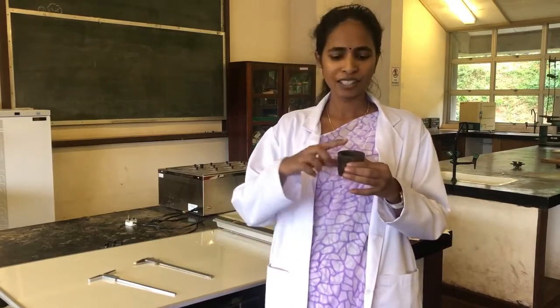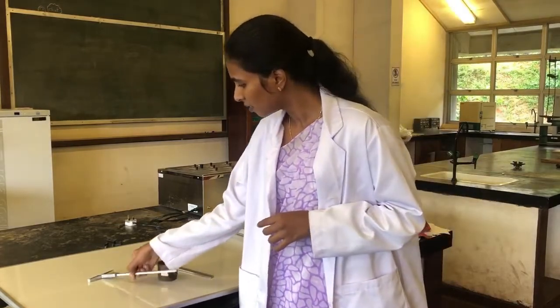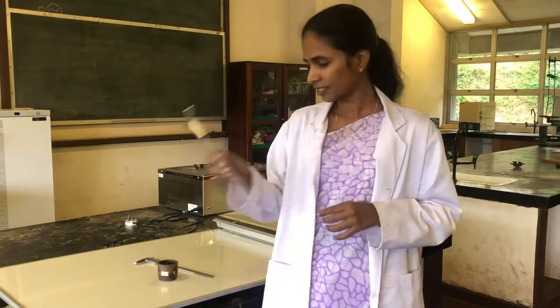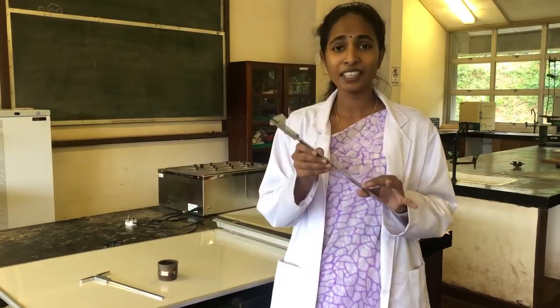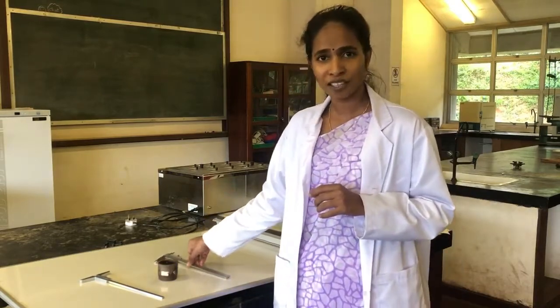Prior to taking the soil samples, we must know the dimensions of the core sampler. We should measure the inner diameter as well as the height of this core sampler using vernier calipers. This is depth vernier caliper that is used to measure the height. And this caliper is used to measure the inner diameter of the core sampler. Now we will see how to take the measurements.